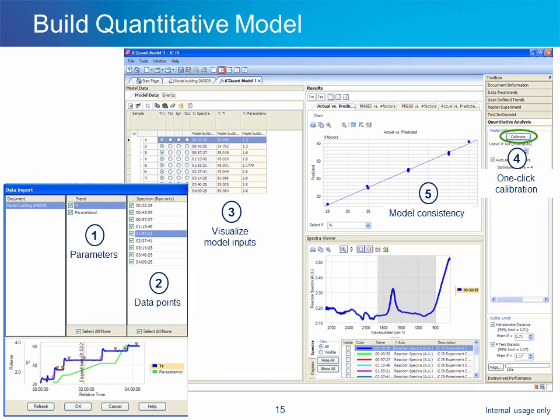To build a multivariate partial least squares quantitative model, we start by simply importing the data from the experiment file, which brings over all the spectra and associated quantitative data. At step 1, we select the trends that we want to import — in this case, not only the concentration of paracetamol, but also the temperature from the EasyMax as a second independent variable. At step 2, we have selected all of the spectra to be imported. After the data is imported at step 3, we can choose for each data point whether we want to use it as part of the calibration set, the test set, or whether it should be ignored. Then we choose the spectral region over which the model will be applied. Lastly, we click on the calibration button at step 4. The goodness of the model can be checked via a number of diagnostic tests at step 5, and the model can be interactively refined to see if any improvements can be made.